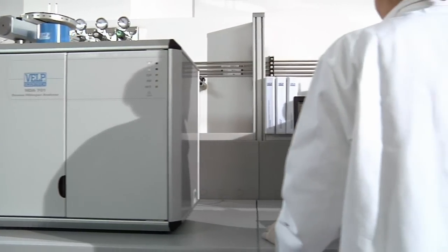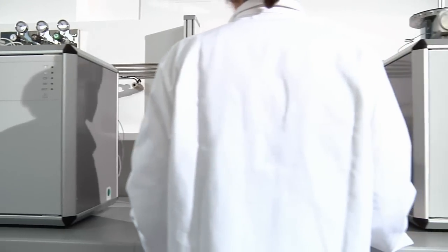The NDA701 Dumas nitrogen analyzer is the comprehensive response to the need to produce accurate and reproducible results in an automated and simple way, according to international standards.